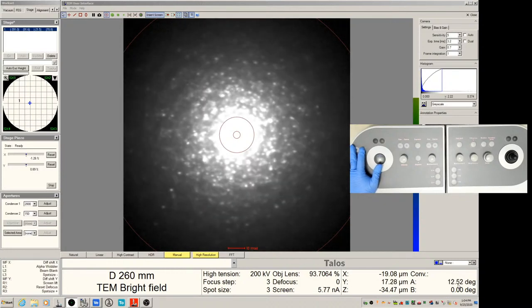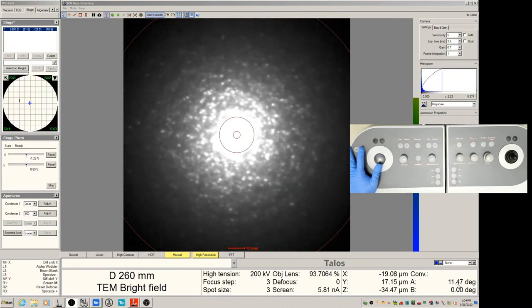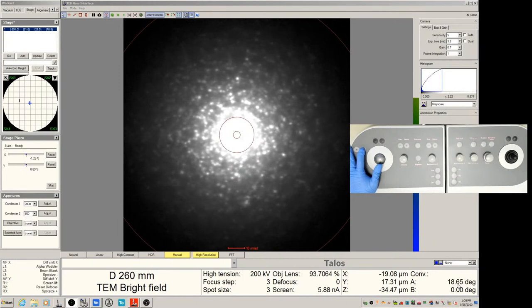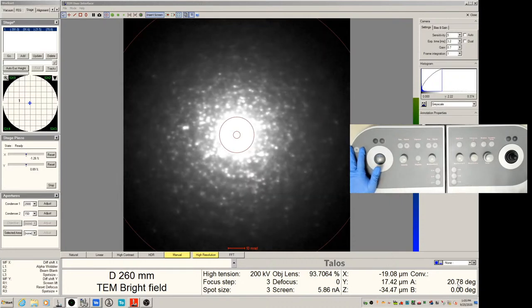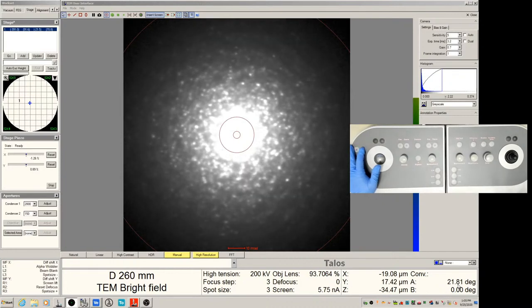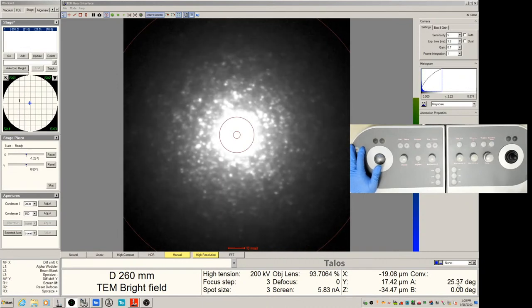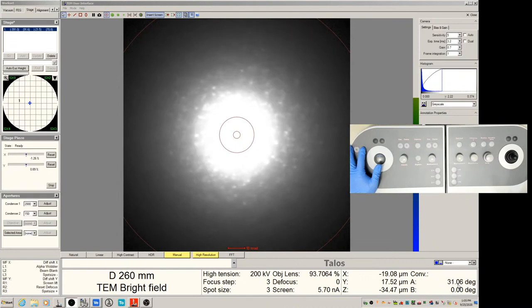There is no harm to tilt it faster, but usually you don't want to do that, because if you tilt it too fast and the tilting hits the limit, there is a possibility to make it crash. The software will detect that pole touch and stop you before you have any physical touch. But if you do that too fast, the software may not be able to stop you in time. So just try to tilt it slowly like that.